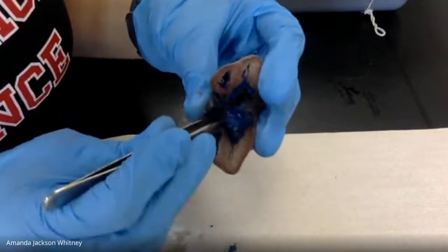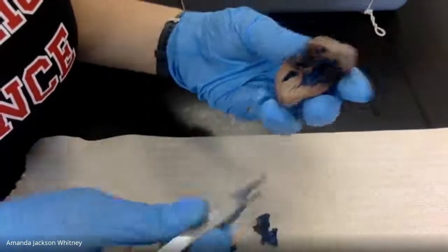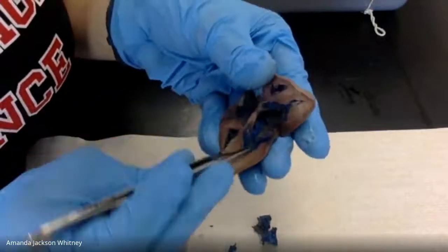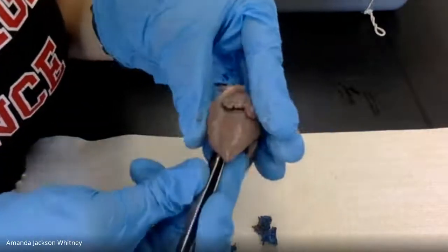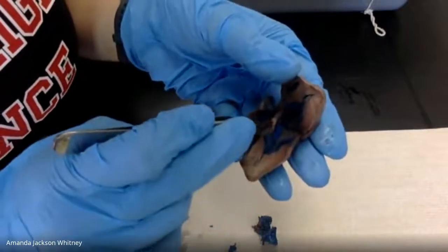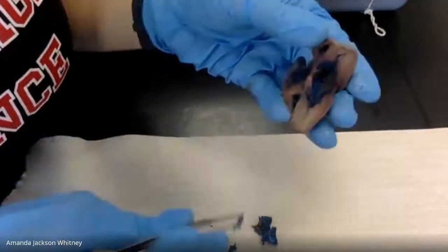So this is all that latex I was telling you about. I'm going to try and pull some of this out so we can actually see inside the chamber. This is a pretty good shot of the start of the, it looks like the aorta. Yep, this is the aorta going from the left ventricle up and then eventually out. I just cut through it, obviously, so we can't see as much.